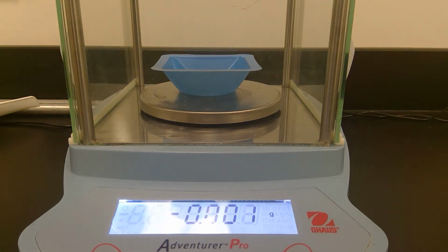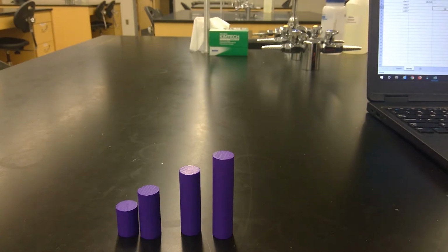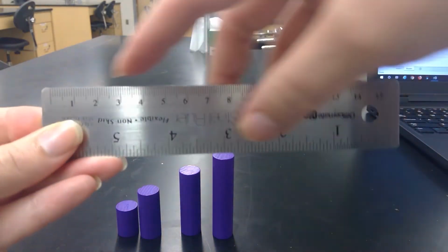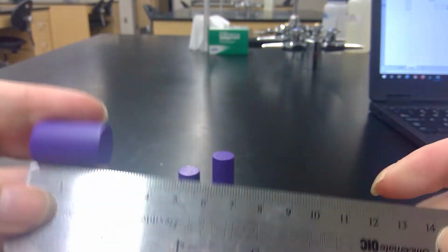All right, so now we will take these back to our lab bench. And so now it says, use a ruler to measure the length of each cylinder and the diameter. Make sure these measurements are in centimeters. So I'll grab a ruler. So we'll want to use the top part of the ruler, or this side, to measure centimeters. And we'll measure the length of each cylinder.